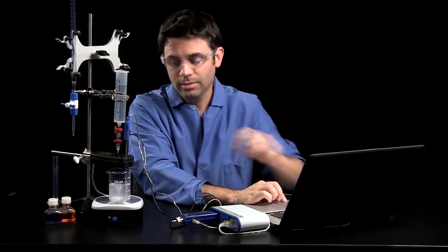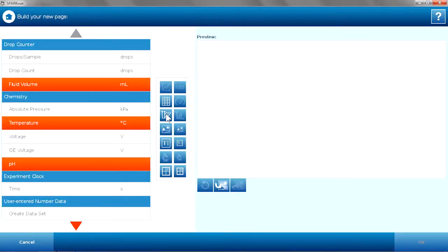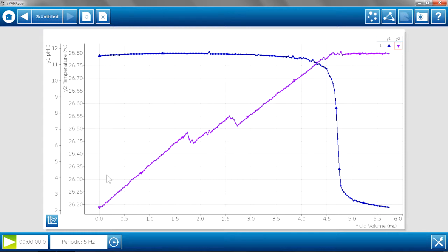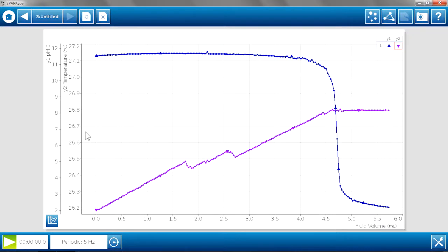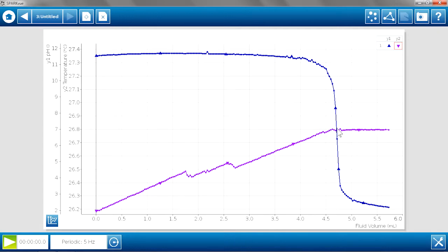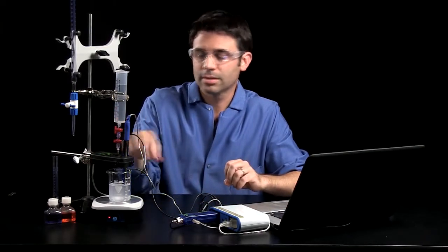Now I can go even further with this because I did have the temperature probe, the stainless steel temperature probe in there. In this case, I'm going to plot my pH and temperature versus fluid volume and just see what the data shows me. Again, using the multiple y-axis feature. And here we have the temperature steadily increasing as the reaction happened. And then once the reaction stopped happening because the equivalence point was reached, then the temperature leveled off and it would eventually start to cool back down to room temperature. And we can see that that point where the temperature started leveling off is approximately the same point as the pH equivalence point. So we can really get an idea of understanding the system that's happening in the beaker with the reactants and the products.